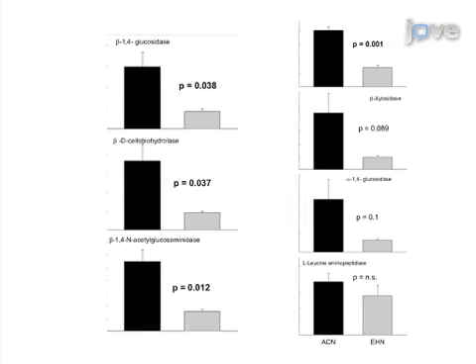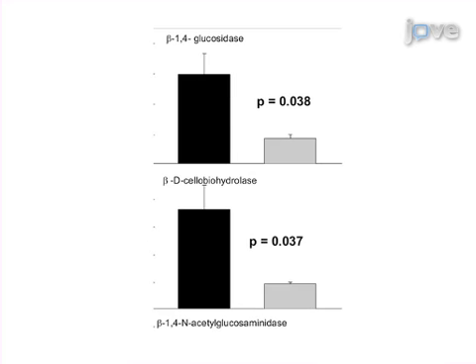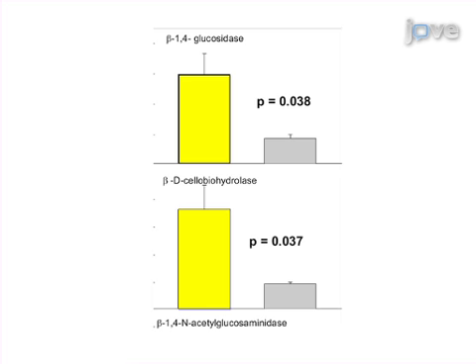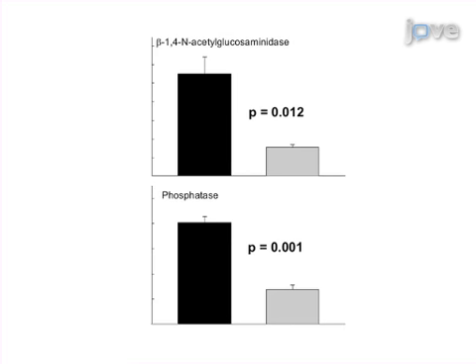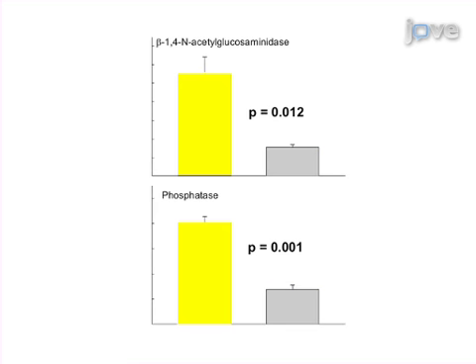However, at 5 to 15 cm soil depths, several potential EEAs did differ significantly. For example, the carbon-degrading enzymes beta-1,4-glucosidase and beta-D-cellobiohydrolase were lower in the elevated carbon dioxide and heating treatment plots when compared to the ambient climate conditions plots. The nitrogen and phosphorus mineralizing enzymes were also lower in the treatment plot, when compared to ambient climate conditions at 5 to 15 cm soil depths.